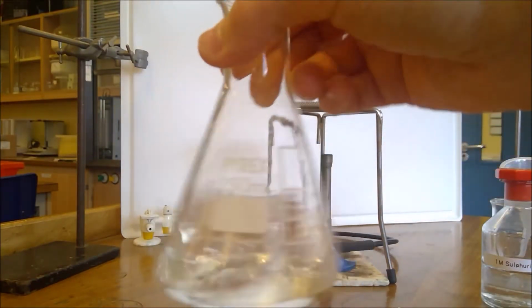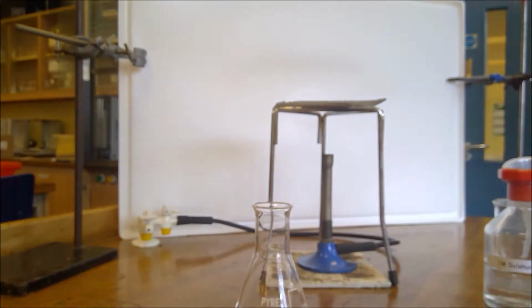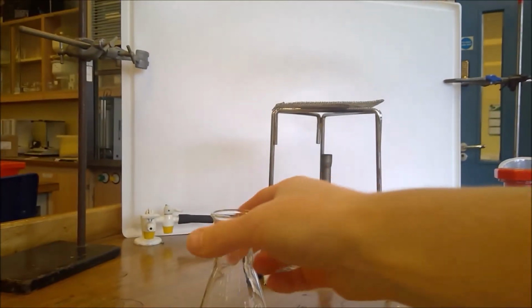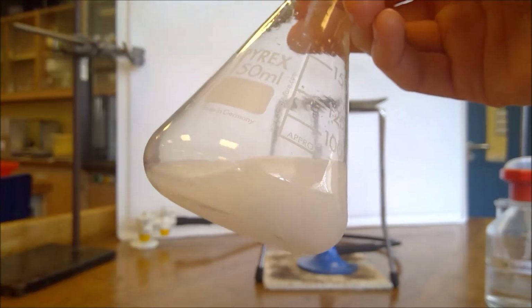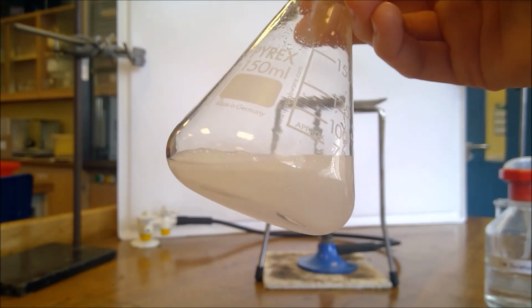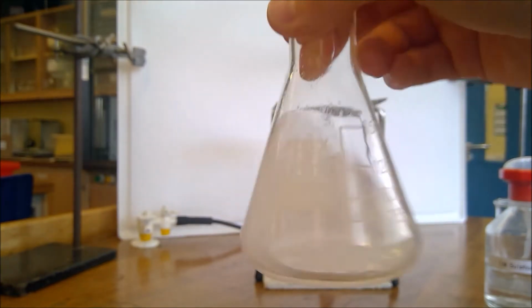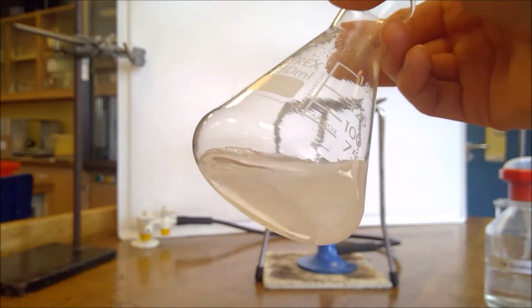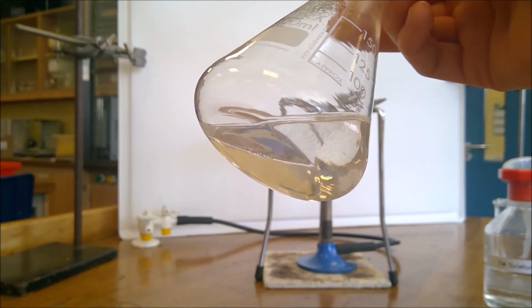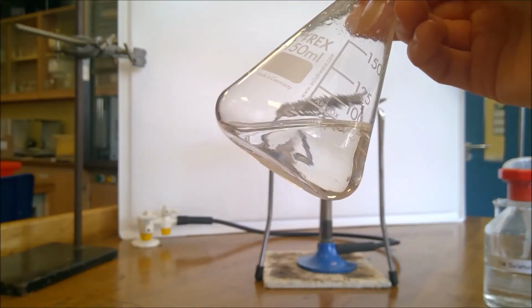So once our first batch of our carbonate has reacted away, what we then need to do is go and add another spatula. And the same again. So we'll swirl this. Now actually you can see a much better rate of fizzing there. Our technical term being effervescence, and you can hear it. And we'll swirl this until we're sure that no further reaction is happening. So you can see the streams of bubbles in our solution there. What we then need to do is keep adding magnesium carbonate until we know the reaction is finished.